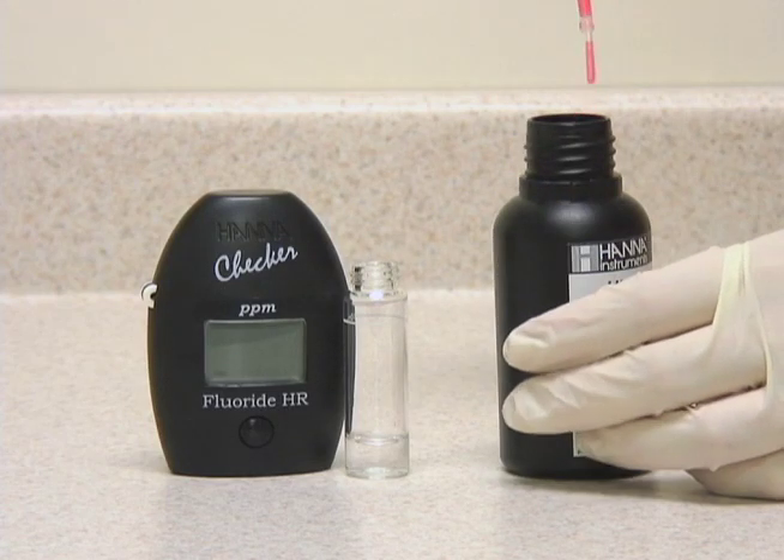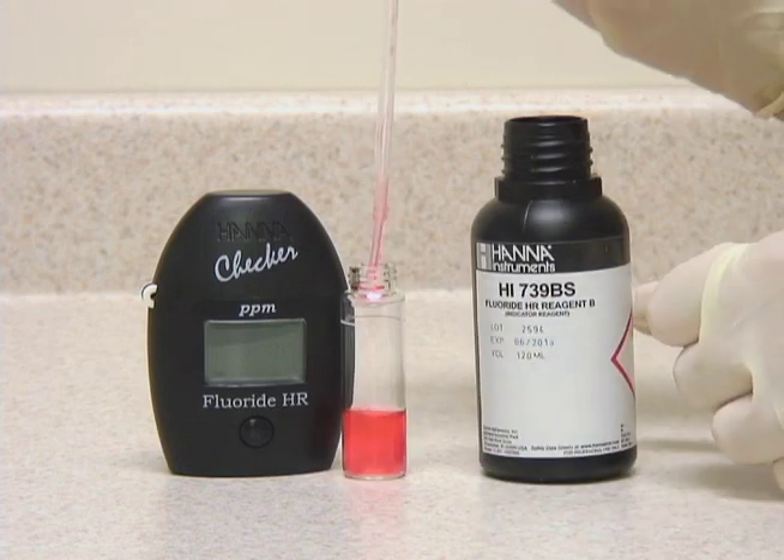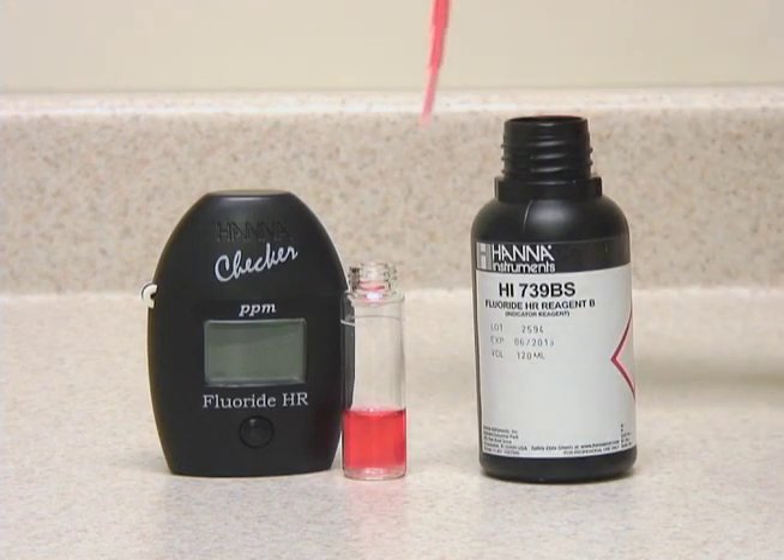Next, we're going to fill the vial to the 10 milliliter mark with reagent B using the included pipette.